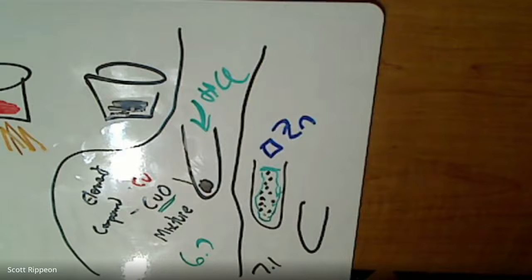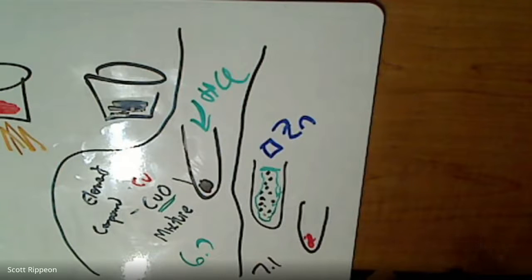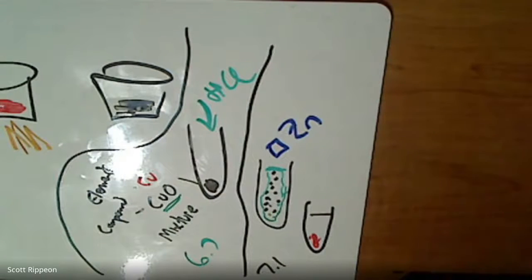So you will see some copper, or some copper-colored stuff, at the bottom. And you'll see some other things that will happen, so you're going to look closely at what goes on there. Now, I'm not going to give you the exact details because I want you to think about it as it's going on. All right? So that's the first bit. Next bit: any questions or problems with the lab? That's one of the things you're going to work on this weekend, to get those two labs finished.